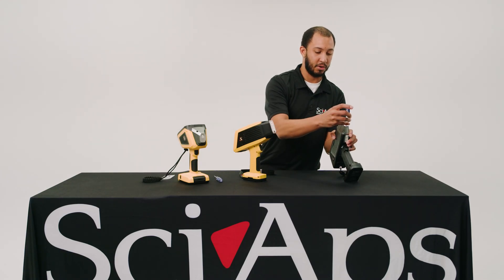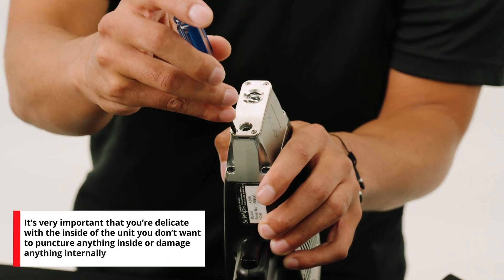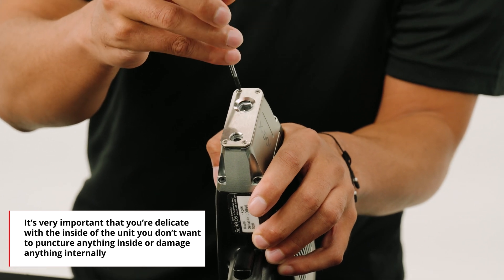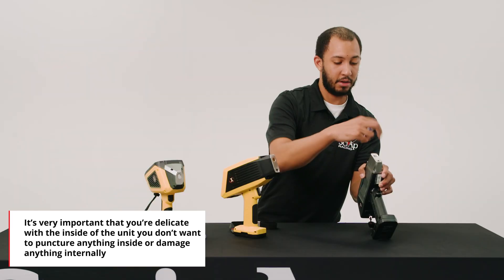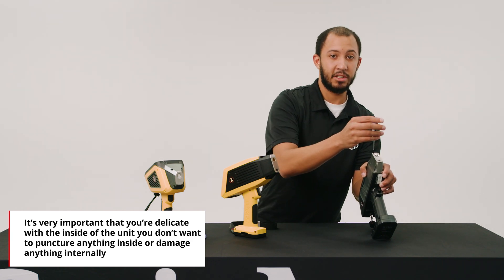First, you have to start by removing the nose plate. After we remove the nose plate, it's very important that you're delicate with the inside of the unit. You don't want to puncture anything inside or damage anything internally.